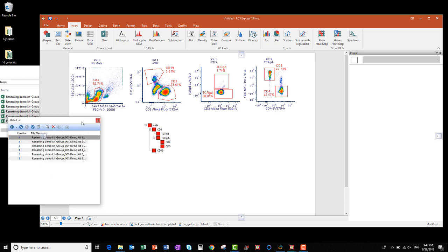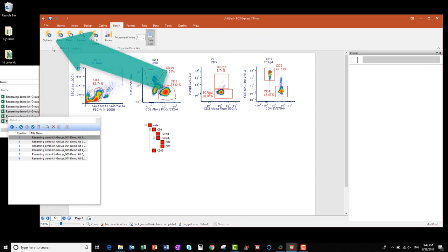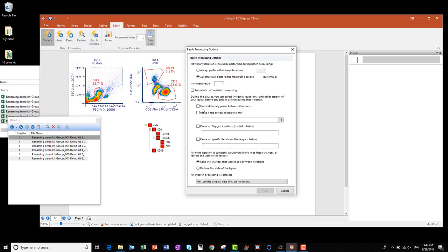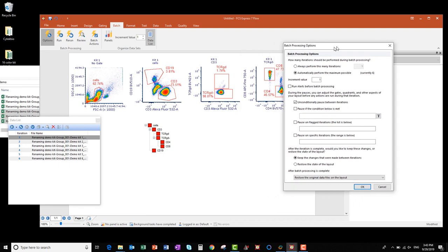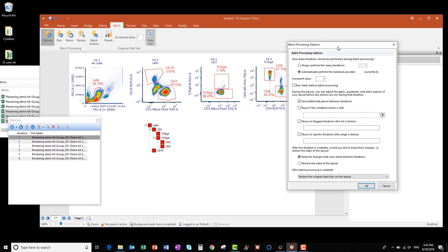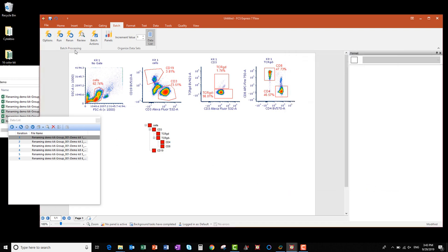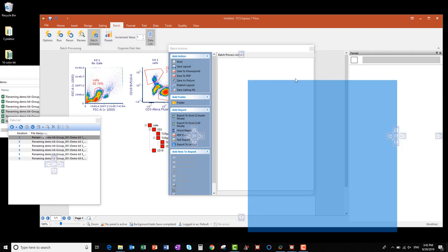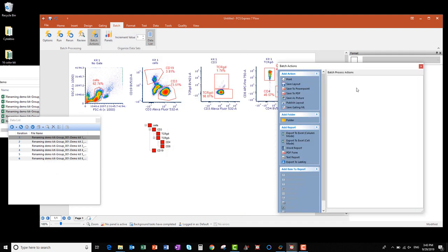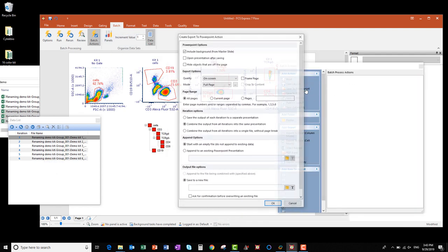To set up the batch processing, go to the Batch tab and click Options. Then check the box next to Unconditionally Pause Between Iterations. This will pause the batch processing after each file is processed so you can adjust gates before proceeding to the next file in the list. Click OK. Next, click the Batch Actions button. I'm going to create a PowerPoint output file by clicking Save to PowerPoint under the Add Action menu.